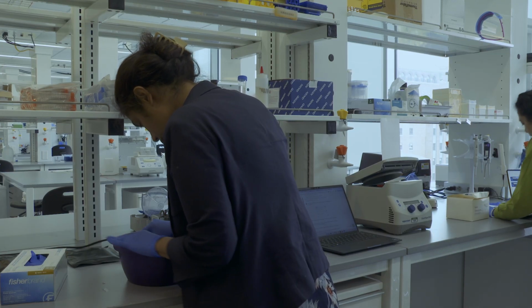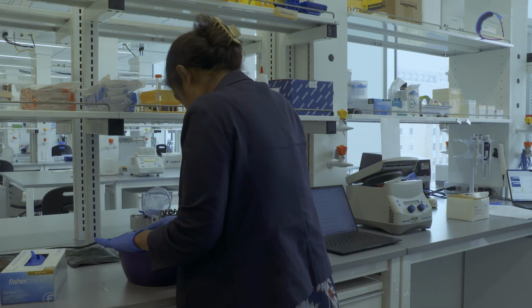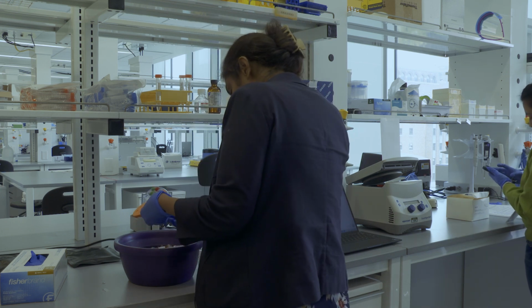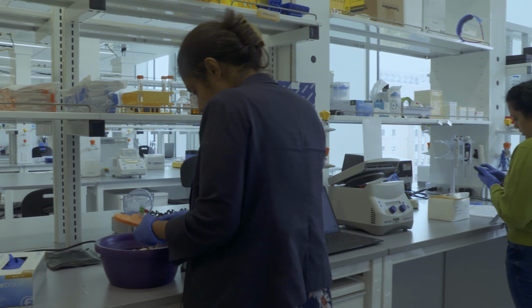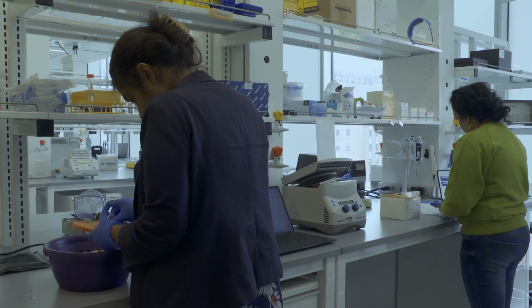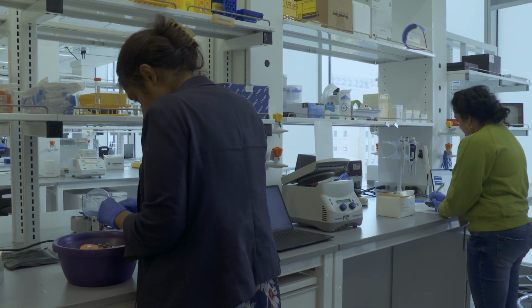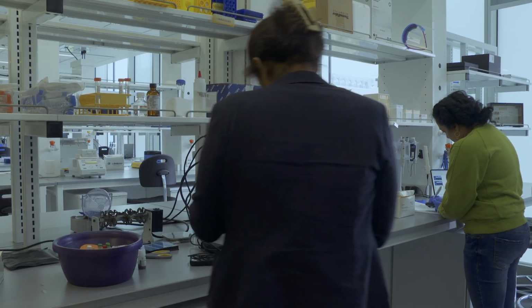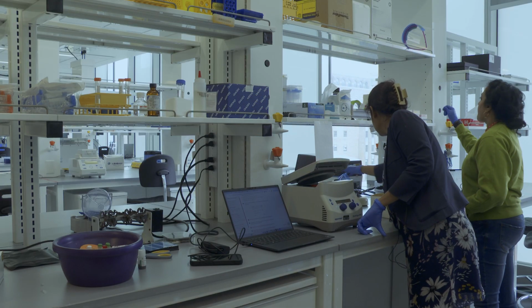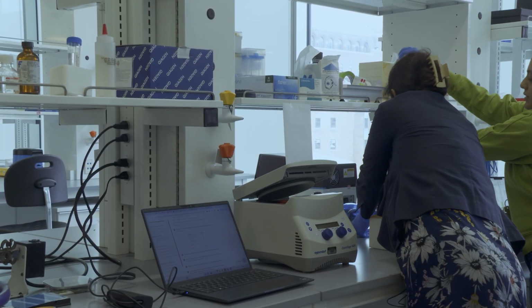21 and the fan mix would be 0.9 multiplied by 7. I think. So here, please. 6.3. Right?